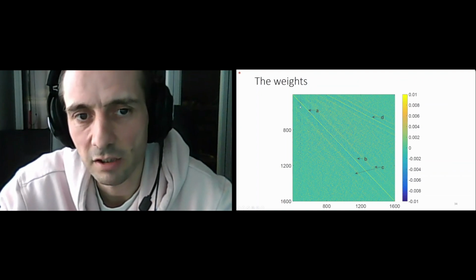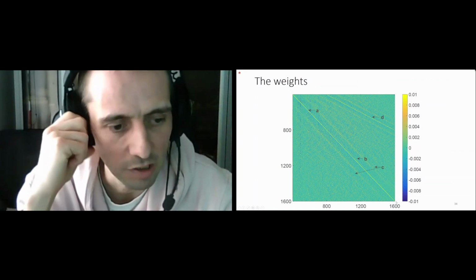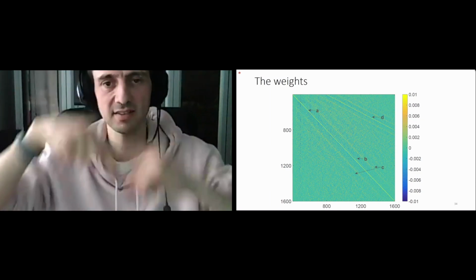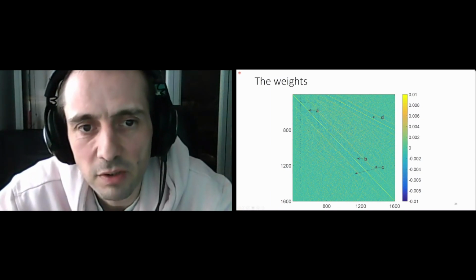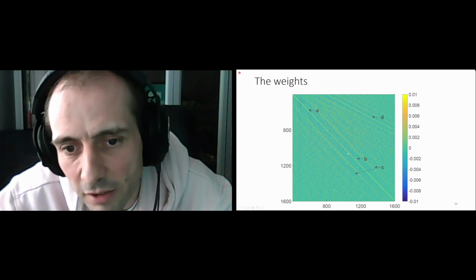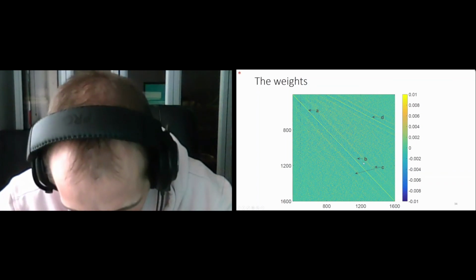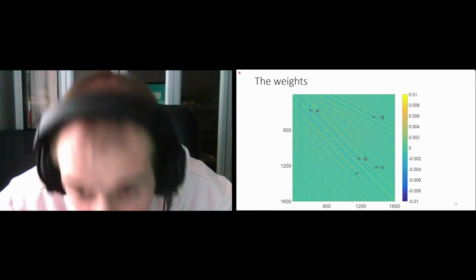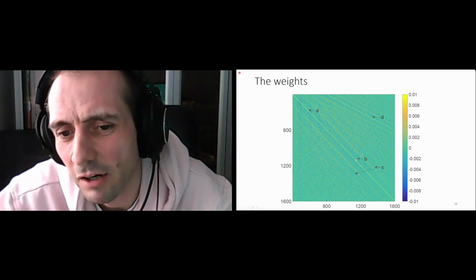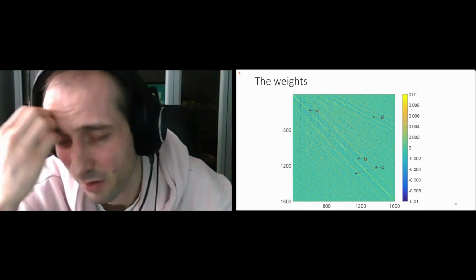then you can see biologically plausible explanations. So here, this diagonal line corresponds to the weight of the correct matching peaks for the primary fragmentation peaks. That means that the peaks were in the same position. Then you can also see some off-diagonal lines here. They correspond to some losses. There are two lines actually, and they correspond to water and ammonia loss.